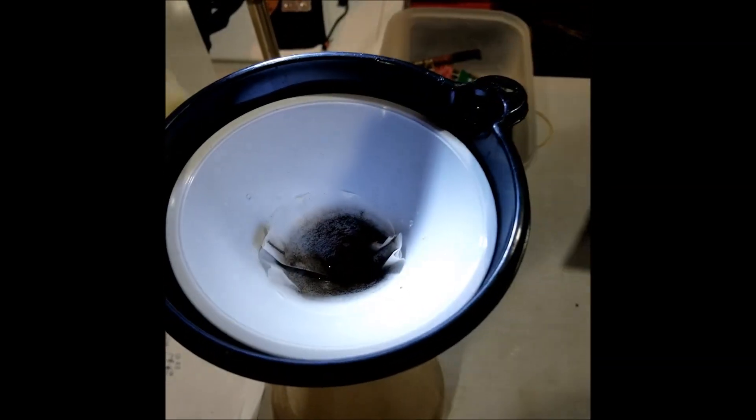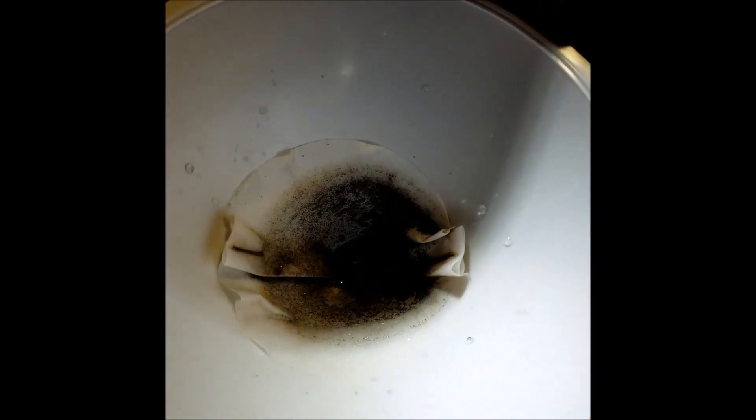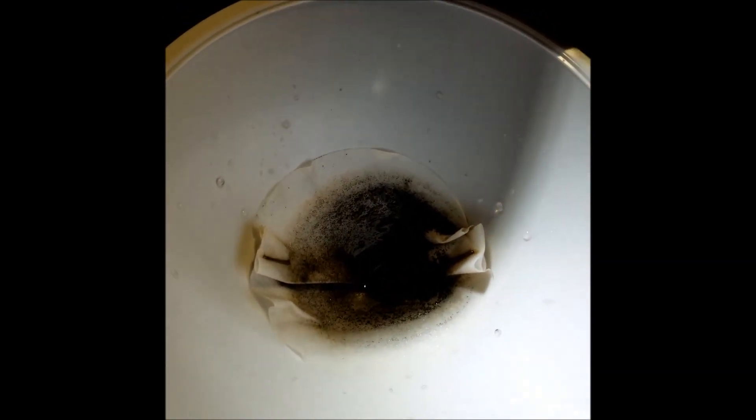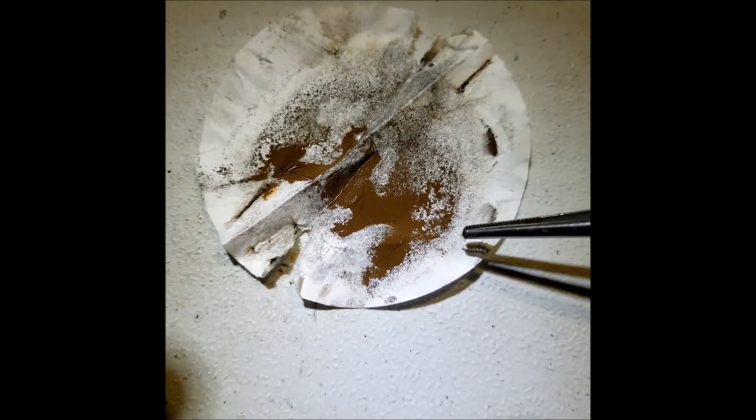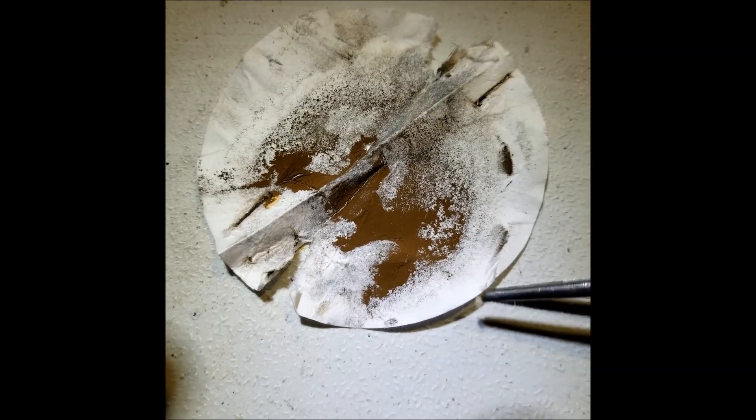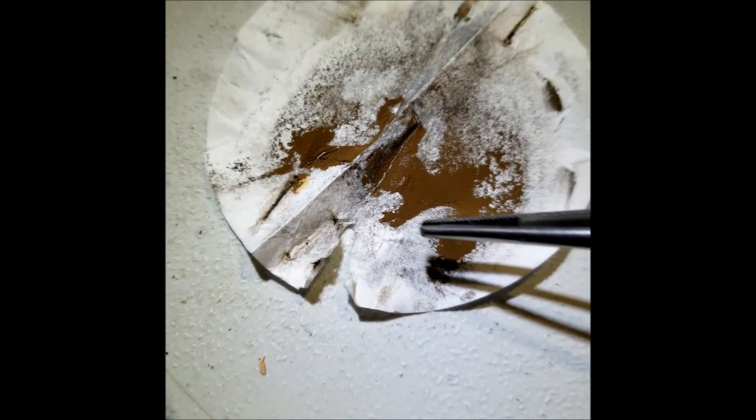So I finished off the filtering. And essentially what you see down there are bits of gold. It's black because of the form it's in right now. And here is the final filter paper with little particles of gold all around it. Just a powder.